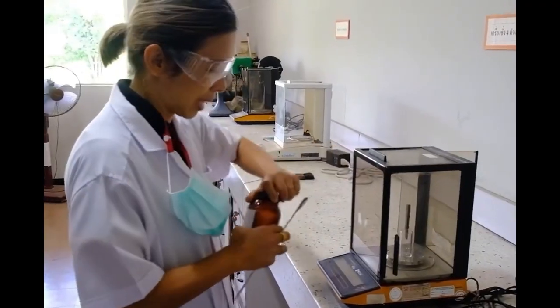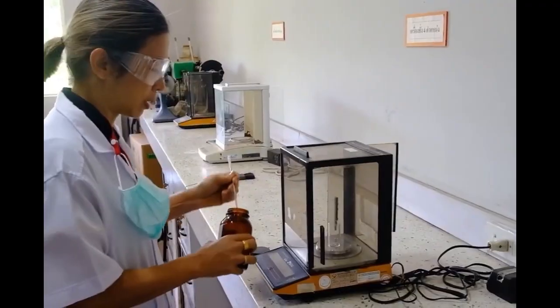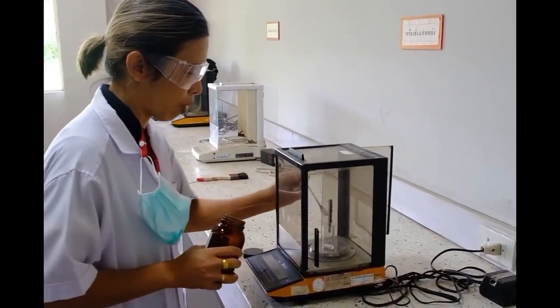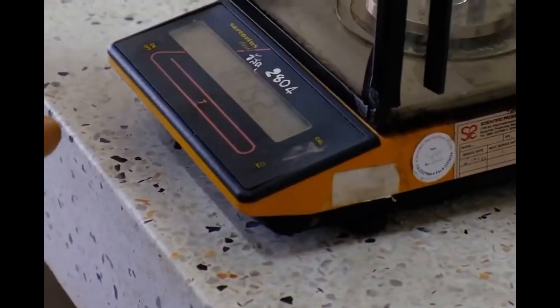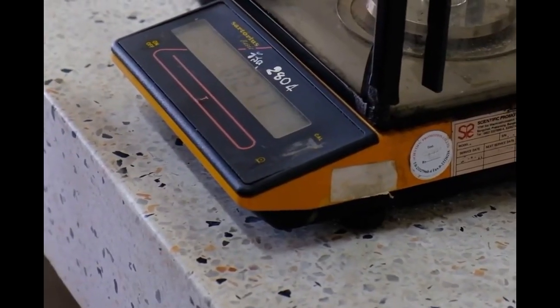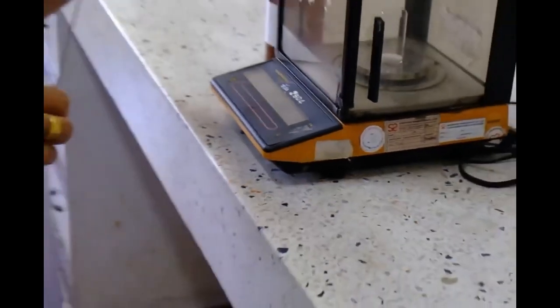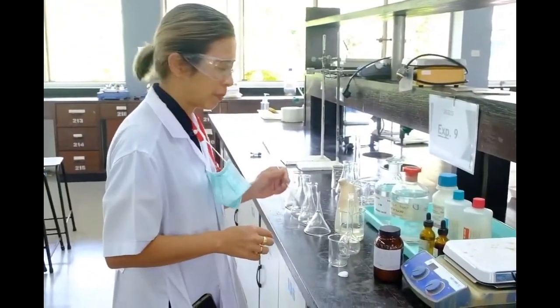Then add the substance. We'll use 1 gram if you're diluting the substance. Be careful not to spill it. This is an approximate value. You should get around 1.018 or 1.02. Record the weight here. This is for calculating the precise concentration of a KHP standard solution, prepared by dissolving KHP.